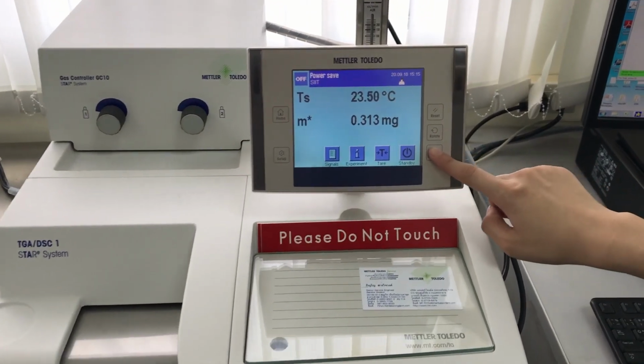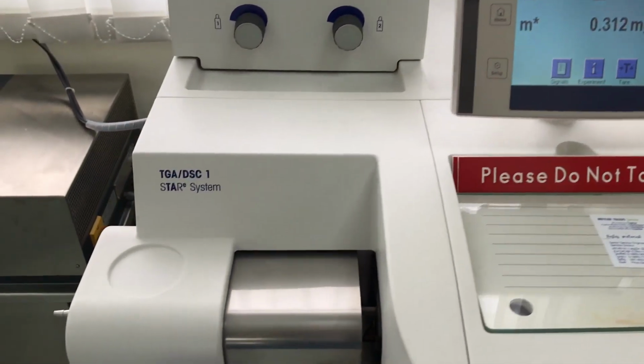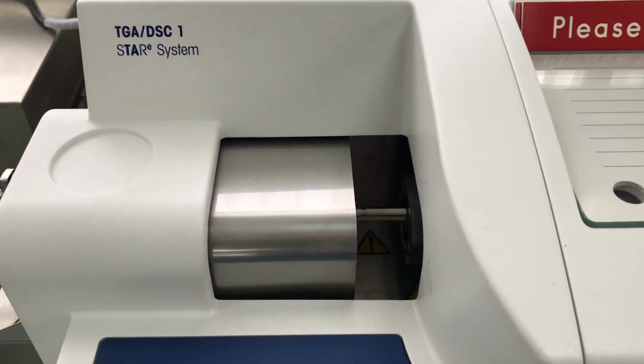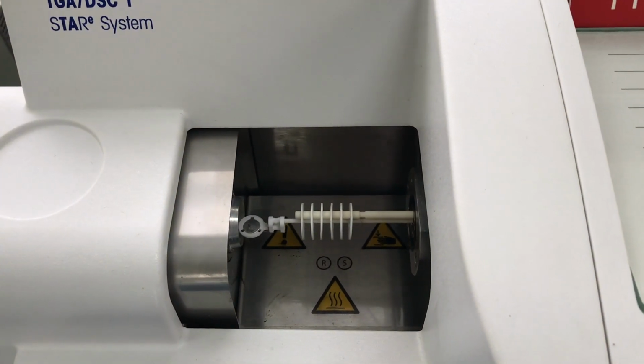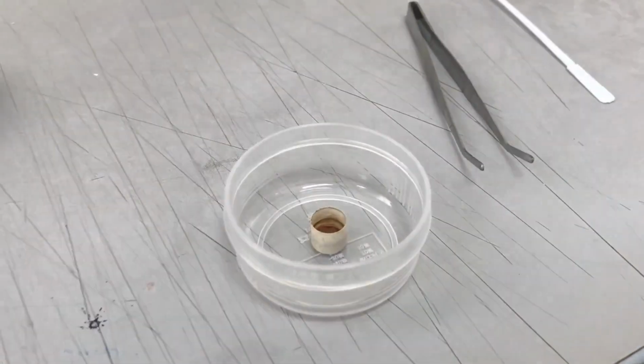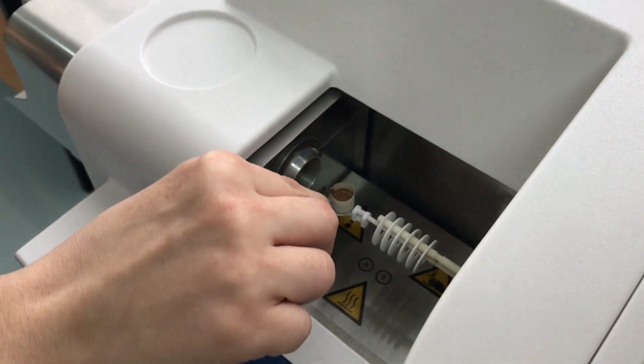Then open furnace by touching furnace. This is crucible. We place our crucible on weight sensor.